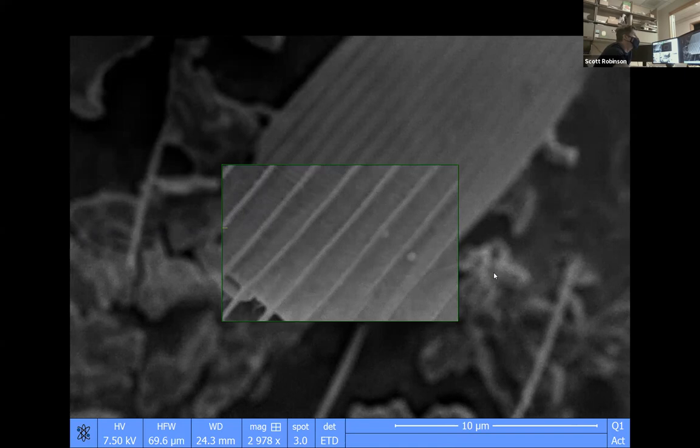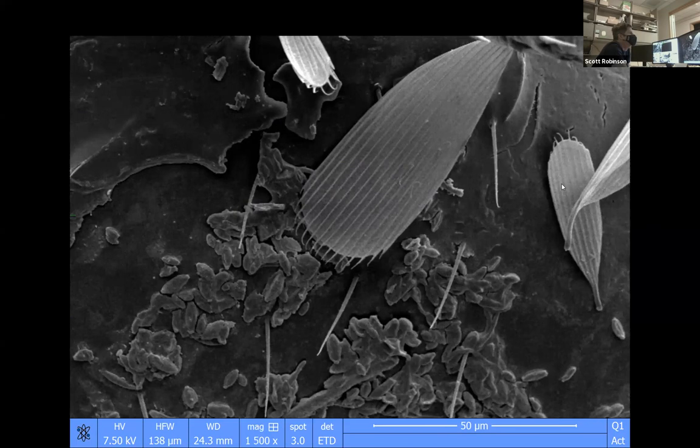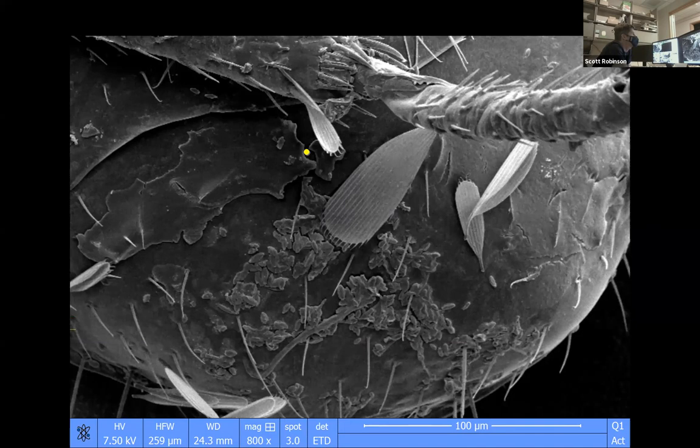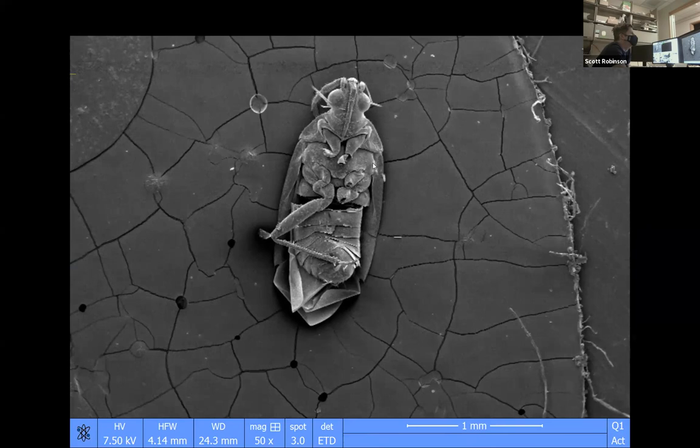Alien. Yeah, it looks like it. So this kind of scale doesn't have any holes in it. This is more like a mosquito scale. And it's kind of like a feather. They function a little bit like feathers do. And then you can see a lot of little mold spores in here. So this little bug that we're looking at was probably in a collection with some other bugs and got rolled around in all the other bugs.